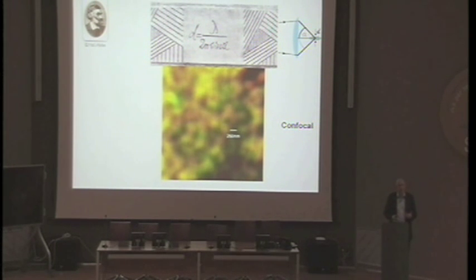The confocal microscope provided advantages over the normal, say, epifluorescence light microscope, such as a kind of 3-dimensional representation of the object if you look deeper down into the cell, so you got a 3-dimensional image, and it also provided background suppression. However, in terms of resolution, the confocal microscope didn't change the game.